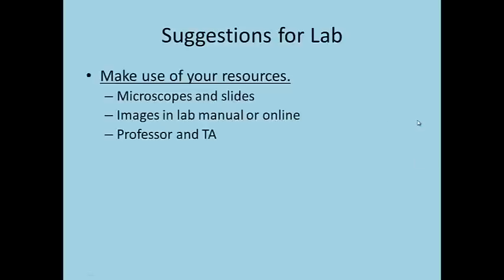As we wrap up with the pre-lab video here, a couple things to keep in mind for this week's lab is that, one, there is a whole lot of material, probably a lot of new material for you, and it tends to be fairly difficult for students. So we want to make sure you're making use of your resources. With your time in lab, make sure you're looking at the microscopes, looking at those different slides, being able to see and identify the different tissue types.